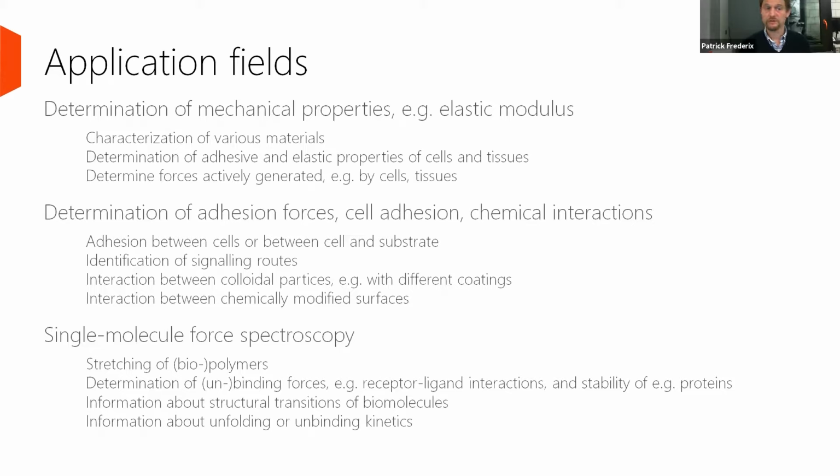This can be interesting for the determination of mechanical properties like the elastic modulus. If you push a cantilever into a sample, you can see how this sample is responding to that force.